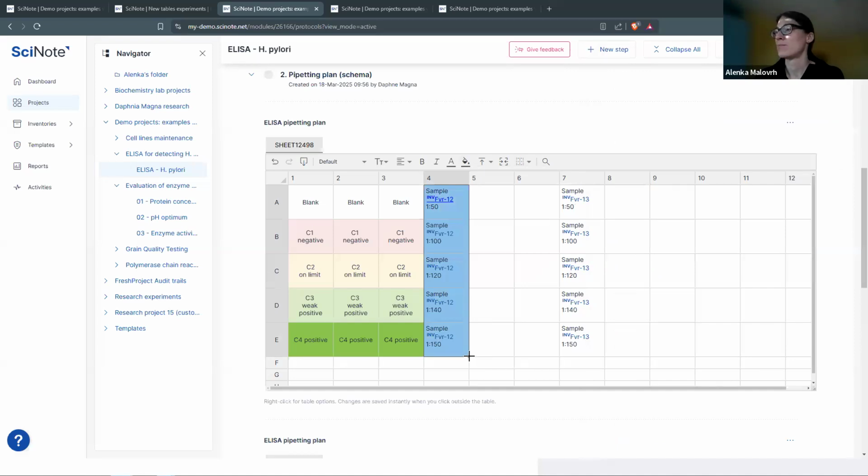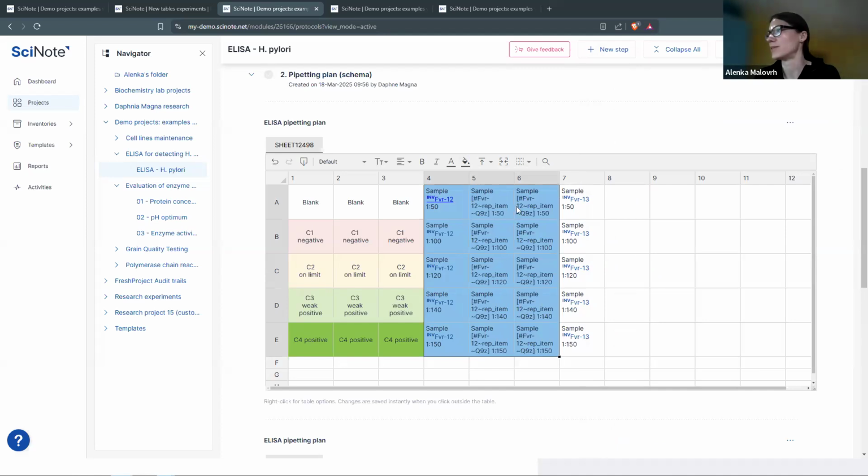And then if I grab and drag the bottom right corner, as you would do in Excel, for example, and extend it over the other cells, I actually extend and copy paste or duplicate my content across multiple cells. And it takes together also the smart annotations and the formatting that I applied, which is pretty handy. It saves a bit of time.